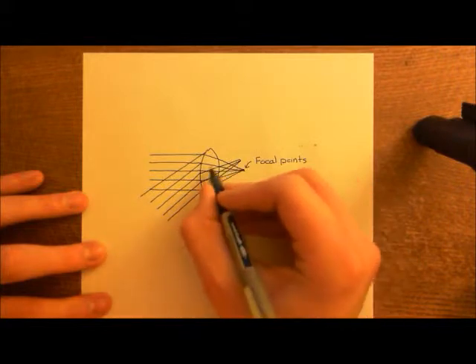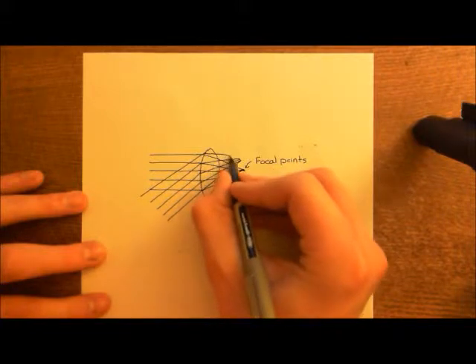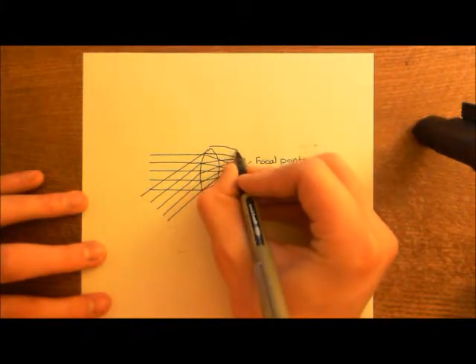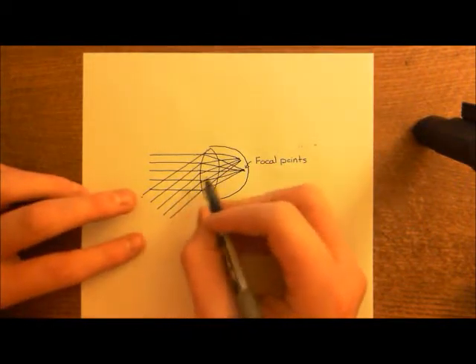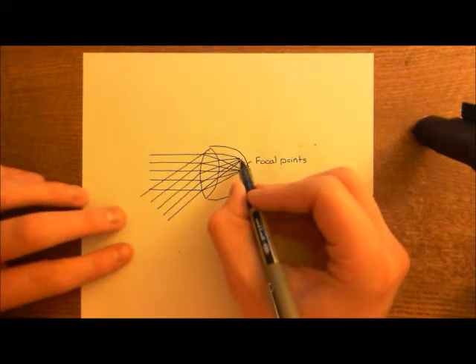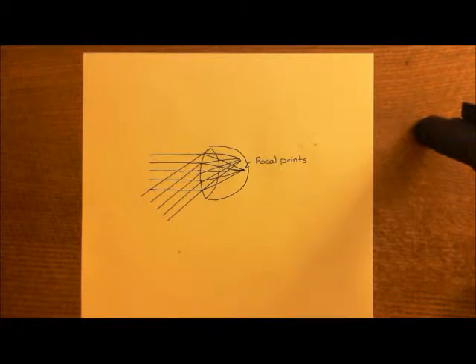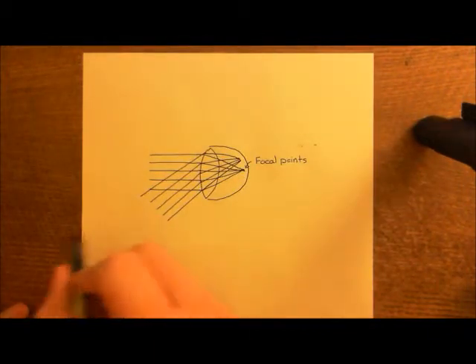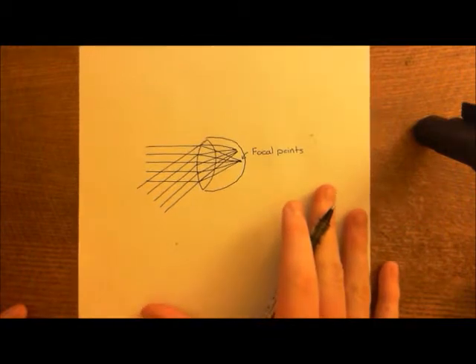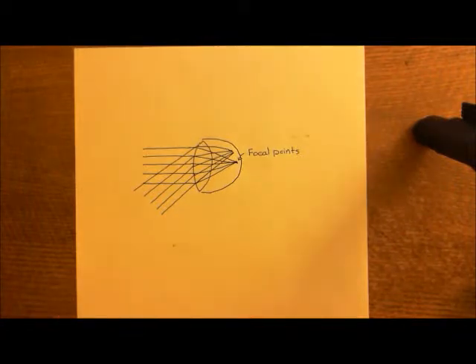I realise I haven't really shown it like it would be in the eye, because the retina is far too close to the lens. But basically, if we imagine the retina here, when the light comes in at different angles, it gets focused onto different points of the retina. But the human eye lens is designed to focus light that is all coming in horizontally, so it will focus light that's all coming from a certain point, far, far away. We need to take that into account when we build the microscope.